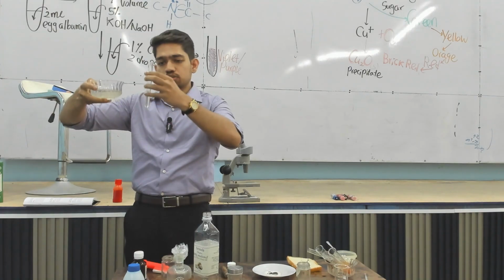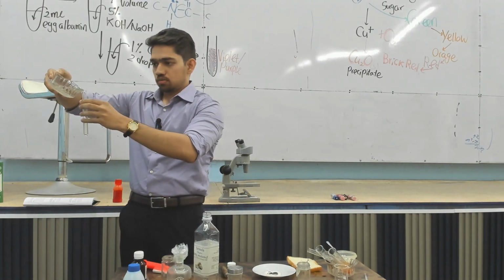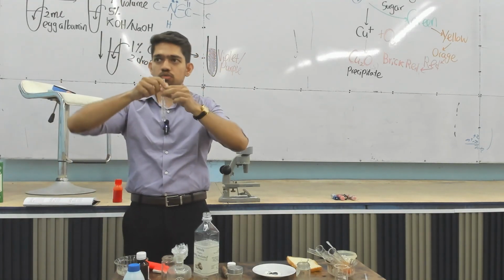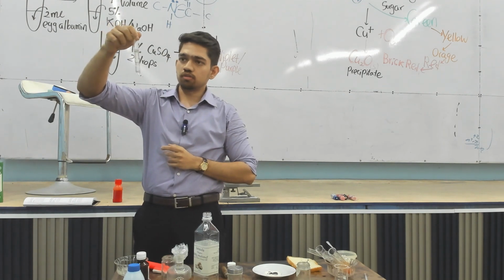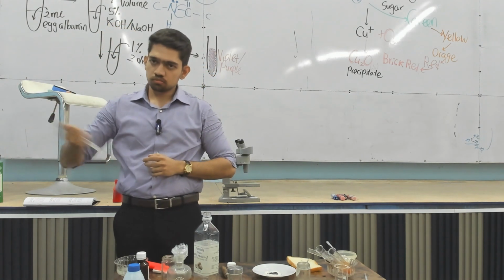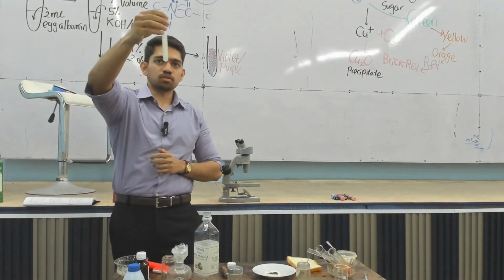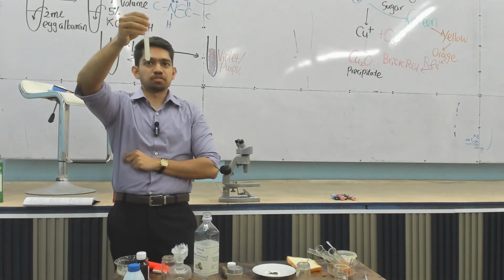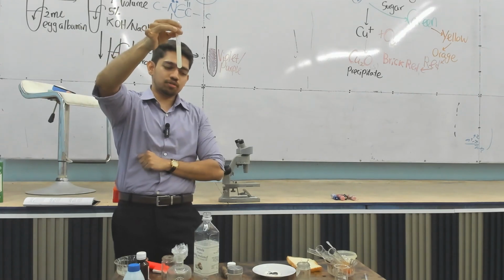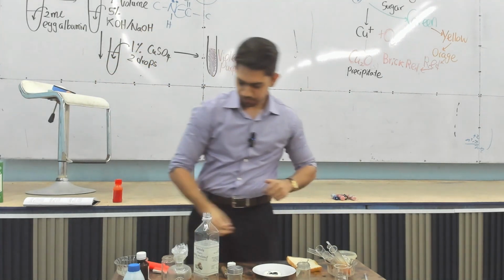So who is going to float and who is going to be at the bottom? Water, no? Water is going to settle to the bottom because water is heavier. Okay. So now we have a sort of a temporary suspension. It's going to get separated. Oil and water temporary suspension you have. Okay.